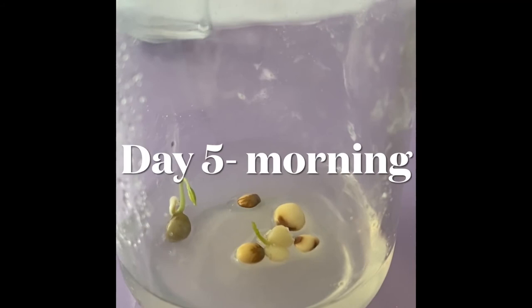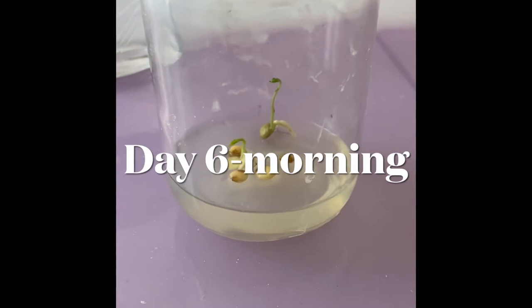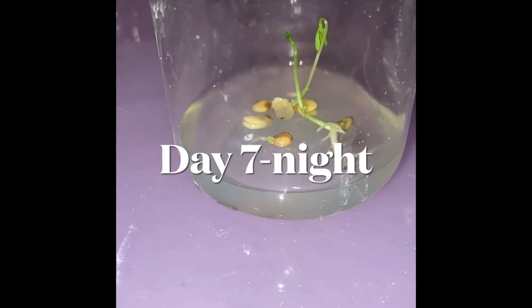On the fifth day, the lentil plantlets continued growing, and it was until this night that the tomato seeds started to germinate. On the sixth day, the lentil plantlets continued growing, and the radicle of the tomato seeds extended. By the seventh night, the plantlets of the lentil seeds were bigger, and the radicles of the tomato seeds larger.